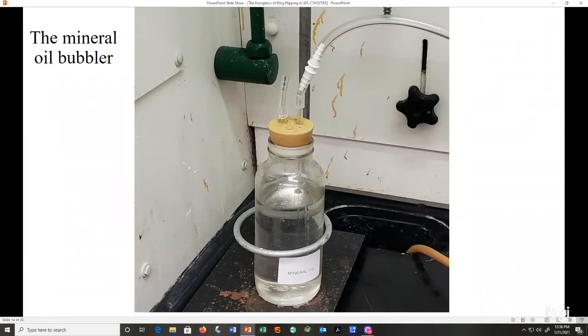And then we have the mineral oil bubbler, and this is to make sure that we don't create an overpressure in our system. So the nitrogen gas that we're supplying always has an open route to this gas bubbler, and so the gas goes down here and the tube extends down into the mineral oil, and so the nitrogen gas can bubble through here, and it just exits right here. It creates a slightly positive pressure in our system while safeguarding that we don't add too much pressure to our system.